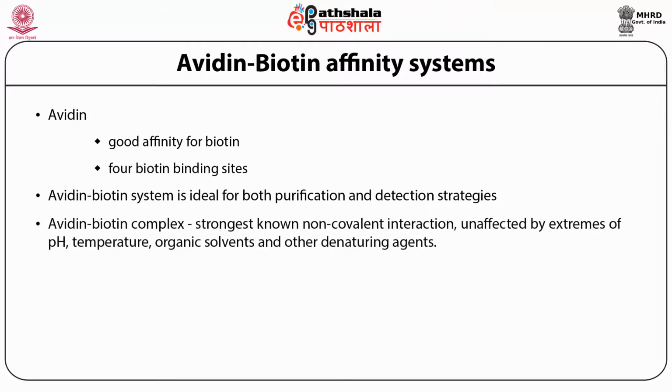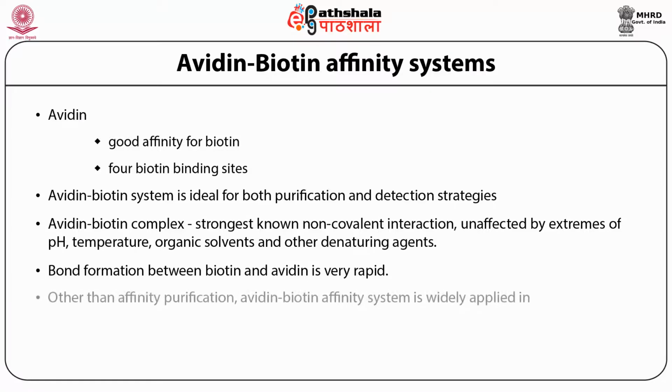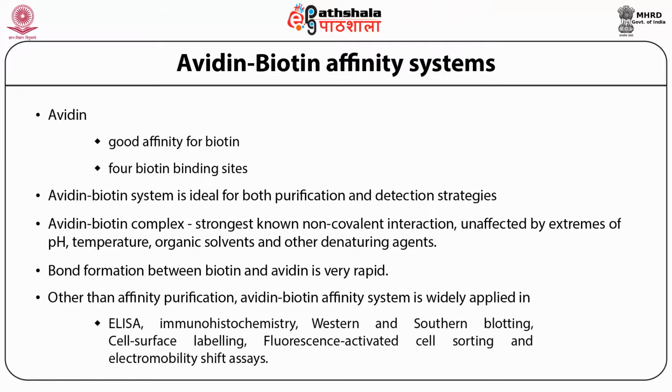Avidin-biotin interaction is the strongest known non-covalent interaction that is unaffected by extreme pH ranges, high salt concentration, temperature, organic solvents, and denaturing agents. Also, bond formation between biotin and avidin is very rapid. Other than affinity purification, the avidin-biotin affinity system is widely applied in Western blotting, ELISA, immunohistochemistry, fluorescence-activated cell sorting, electromobility shift assays, and cell surface labeling.